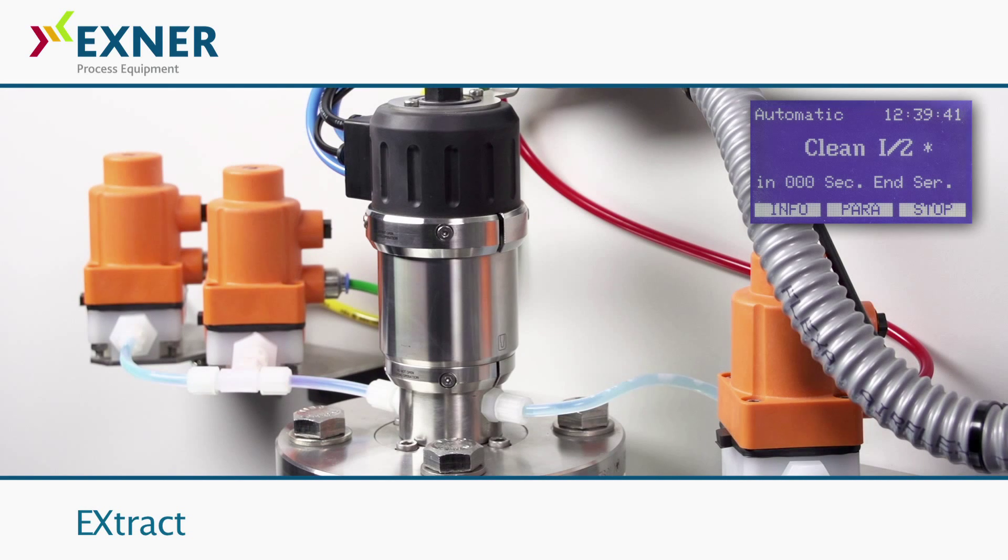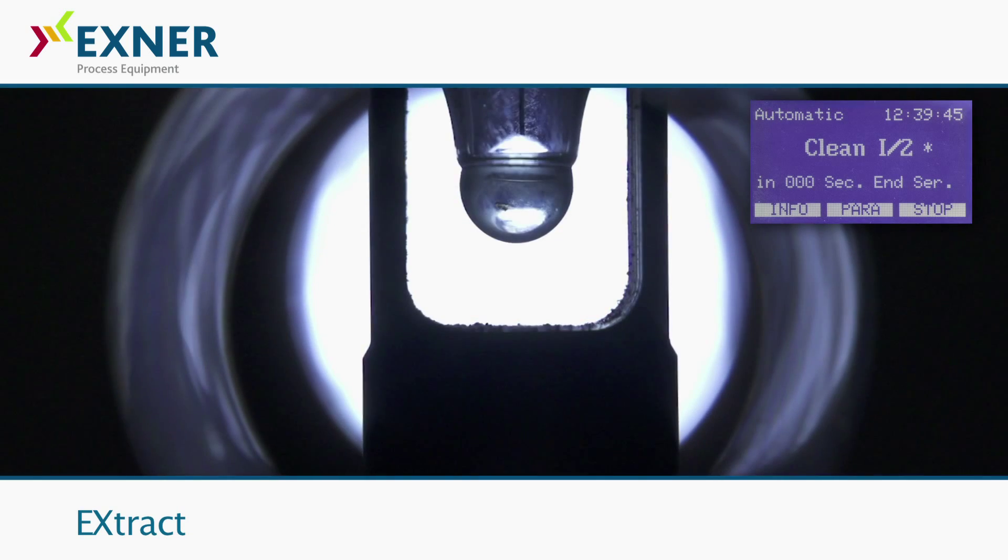After completion of cleaning, the sensor is reinserted into the liquid and again delivers accurate readings.